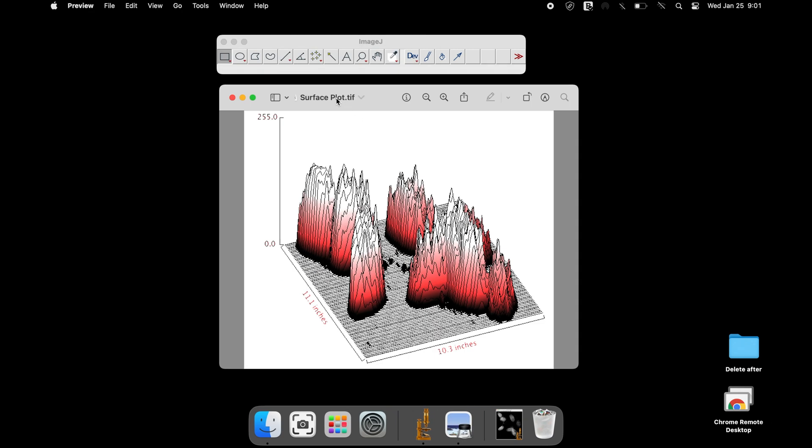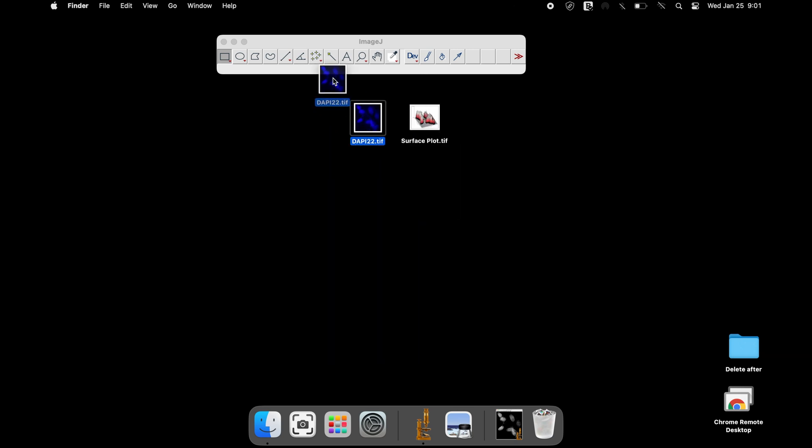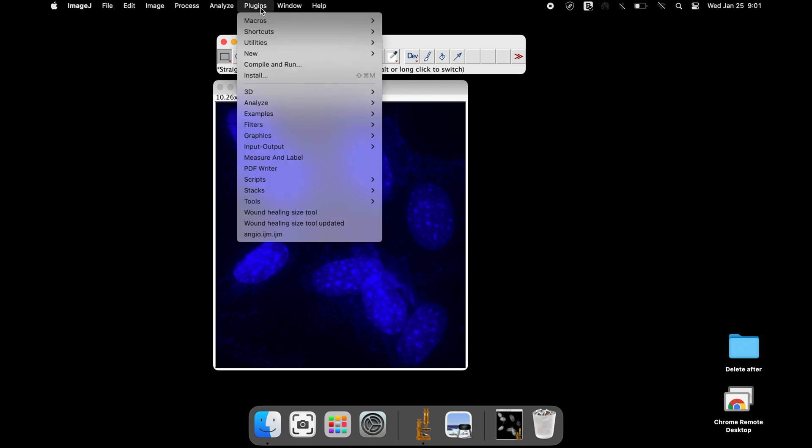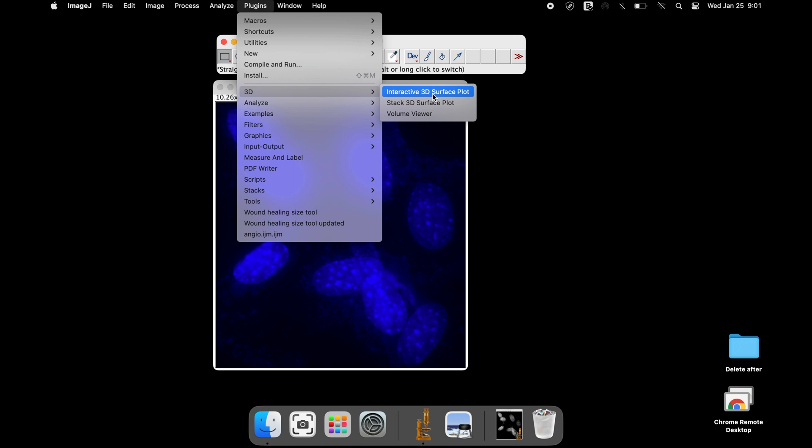To use the 3D interactive plugins and obtain the surface plot, open the image of your interest in ImageJ software. Click on Plugins, 3D and select Interactive 3D surface plot.